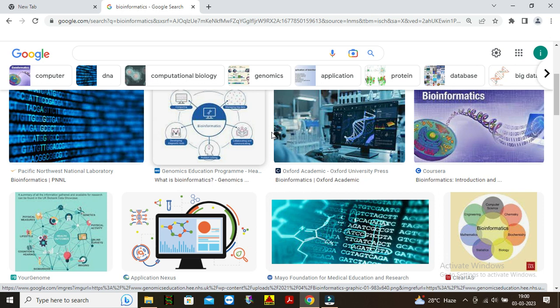Due to the importance of the disulfide bond in protein folding and structural stability, artificial disulfide bonds are often engineered by cysteine mutation to enhance protein stability. So, today we will see how we predict the number of disulfide bonds present in any given protein sequence. For this we can use a very important tool, the disulfide tool. How we can use this tool and how we can interpret its results will be clear in this video.